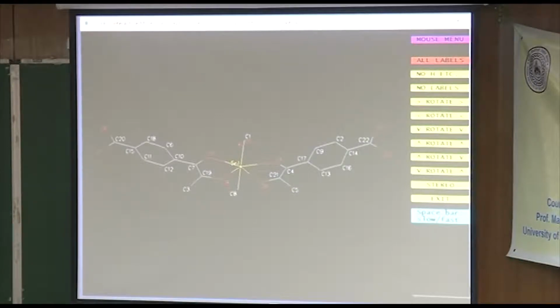I suspect those are nitrogens, not carbons. Another key would be to look at bond distances and bond angles and that sort of thing. And the other ones that are too small are C19 and C21. So what if those are nitrogens? They might be. So we could go through and do pick again, or we can just name them.